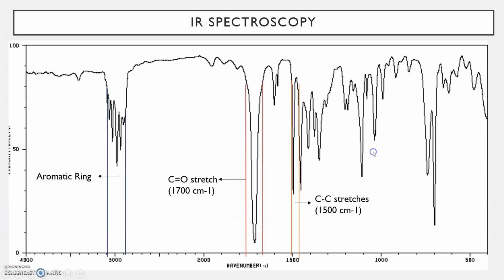Okay, so then we also got this IR spectroscopy to identify our compound, and we do see this aromatic ring region, which is awesome and is confirmation of an aromatic ring, but we will keep in mind that it could potentially be something else.